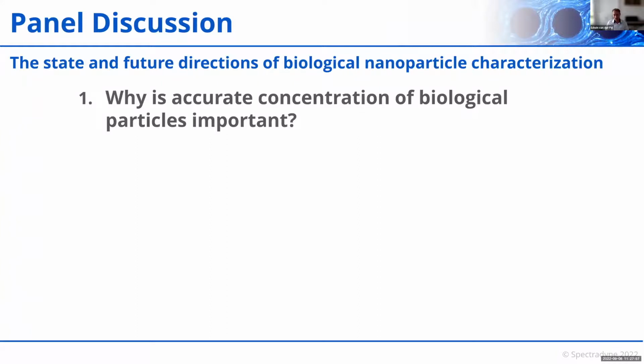Right. If I could translate what you were saying, Dr. Jones, the tumor example, you're essentially saying that the thorax measurement is defined by the limit of the area where the limit of detection is the thorax, right? And in our kind of measurement, the analogy would be that within this size range, these are the number of particles that were counted, right?